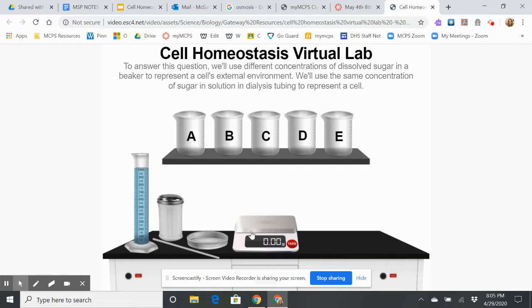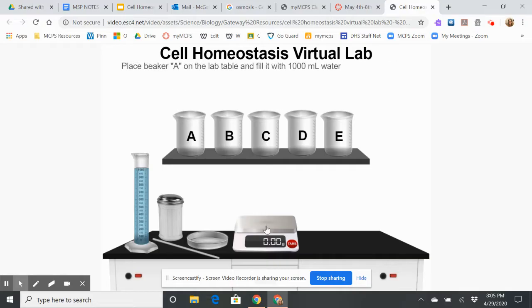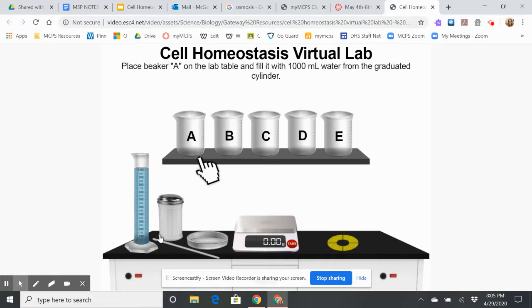Here are my lab materials. I've got a balance, I've got sugar, I've got a graduated cylinder with water, and I've got a stirring rod.